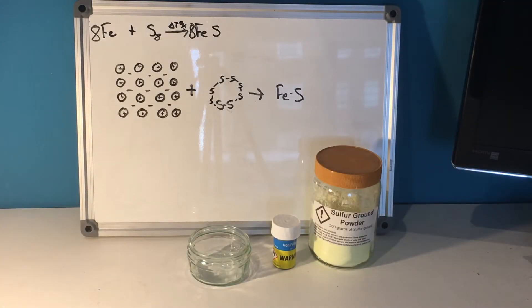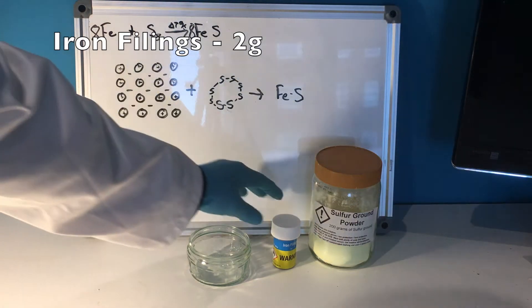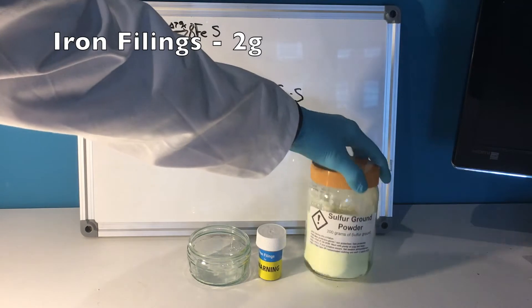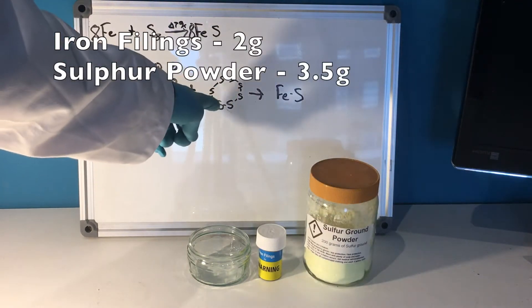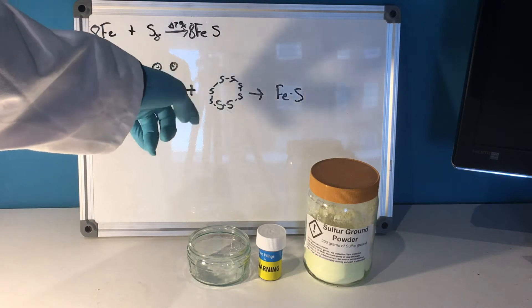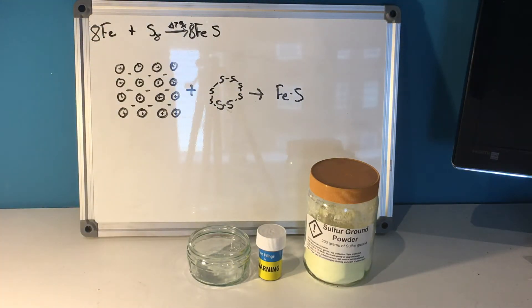Hello! Today I'm going to be making some iron sulfide by reacting metallic iron, in the form of iron filings, with some sulfur. This will be in the form of cyclooctasulfur — a ring of eight sulfurs.